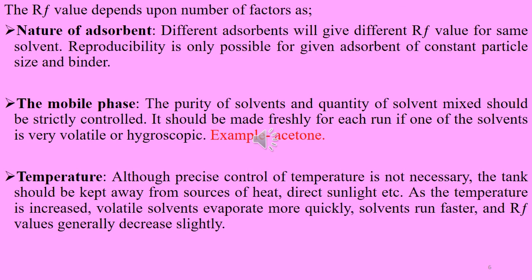the tank should be kept away from sources of heat, direct sunlight, etc. As the temperature is increased, volatile solvents evaporate more quickly. Solvents run faster and RF values generally decrease slightly.